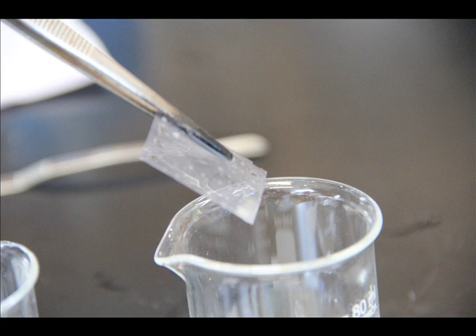The enzyme used in this experiment, trypsin, is a protease that dissolves proteins such as gelatin. Proteases, or enzymes that break down proteins, are an extremely important subclass of enzymes. In this experiment, gelatin, a protein which is essentially a series of amino acids, was hydrolyzed with the help of the enzyme trypsin, C35H47N7O10, to break down the peptide bonds between the amino acids.